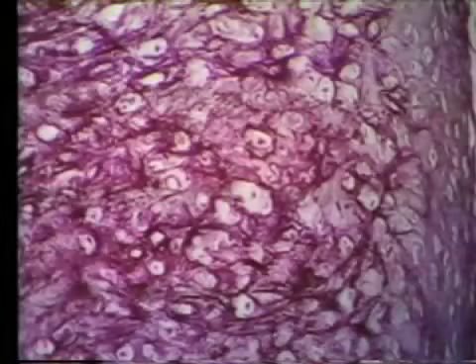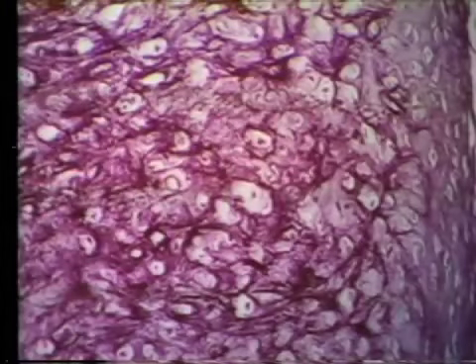What name is given to these groups of cells? Number 4, what type of cartilage?